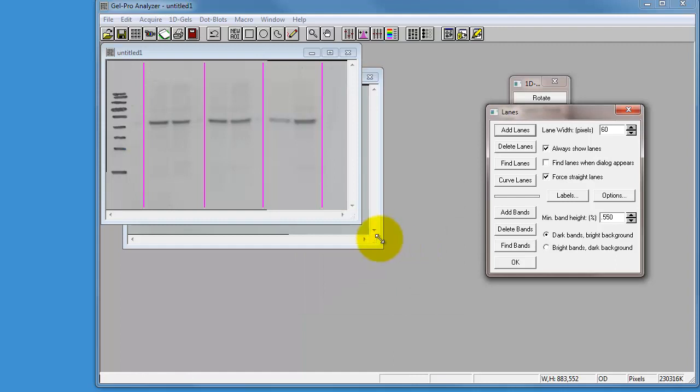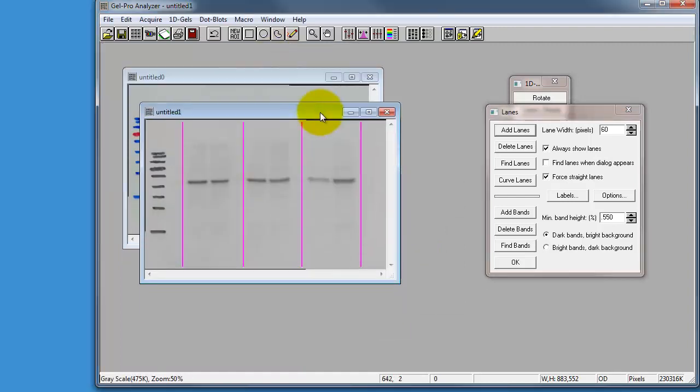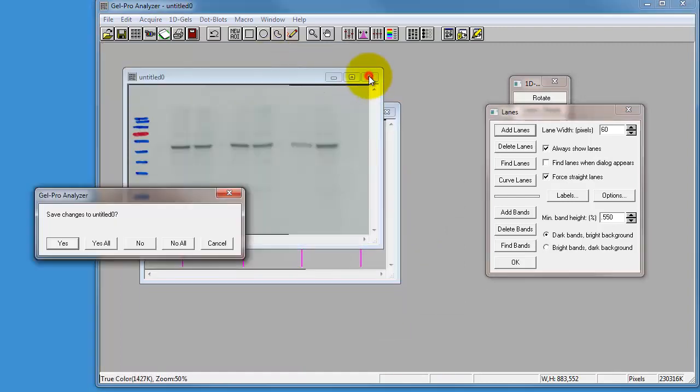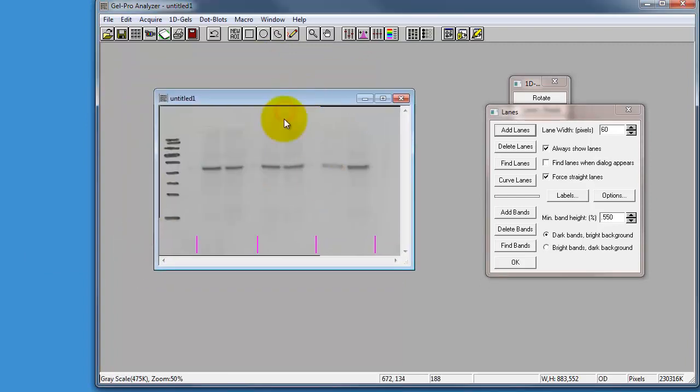And what it's done for us now is it's made us a grayscale version of the image. We don't need to save that one, and this is our grayscale image, and we can add various lanes to it.